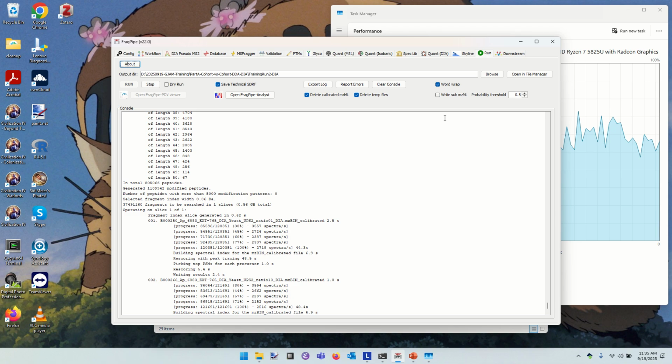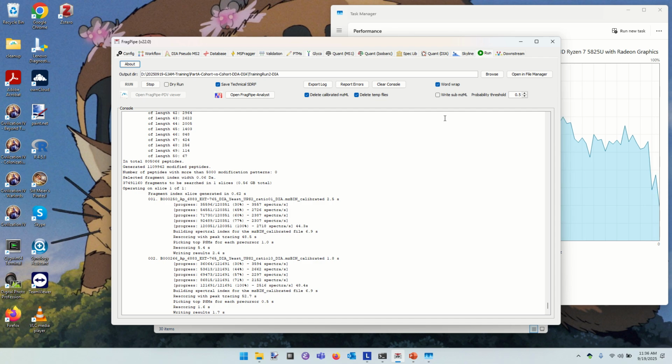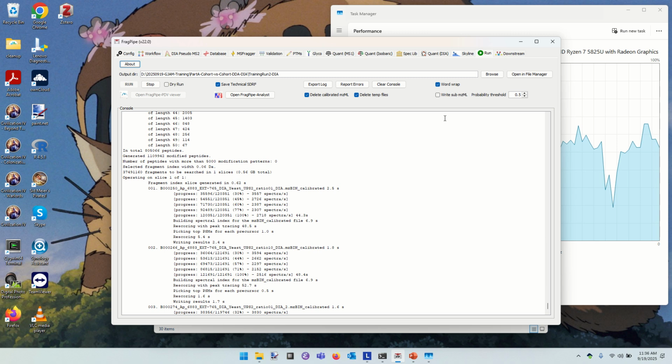And within the identification step, we need to be able to recognize that multiple time slices, multiple MS scans for this set of precursors, are giving us multiple snapshots of the same peptide's evidence. Where in a DDA experiment, we expect each MS to be our only line of evidence for some particular peptide, in DIA we really need to take account of the fact that the fragments for this peptide are observed multiple times.